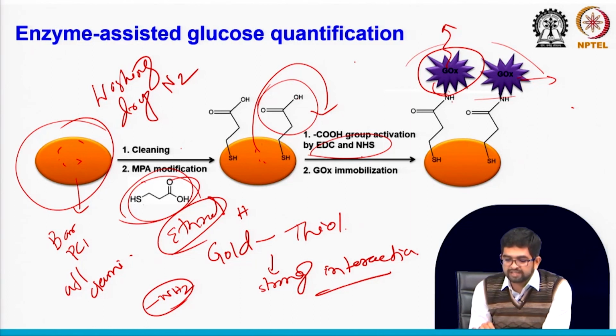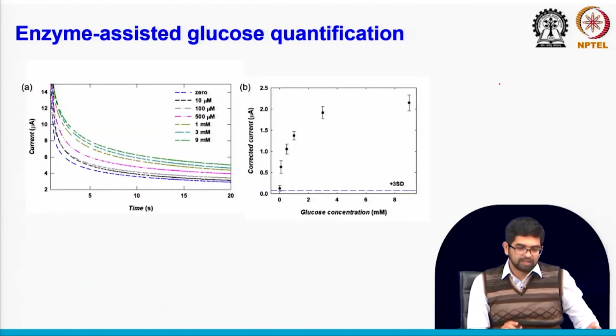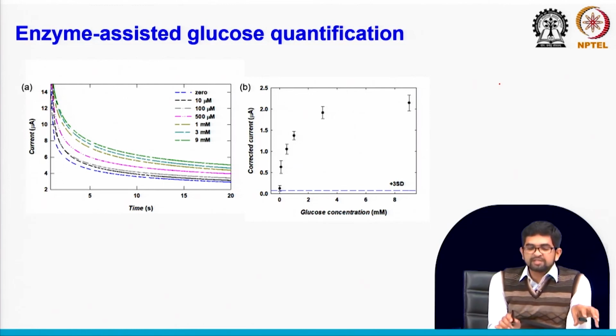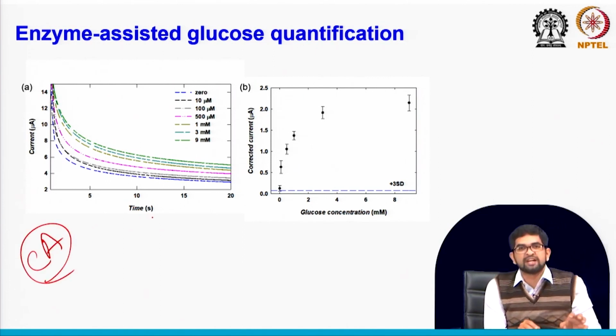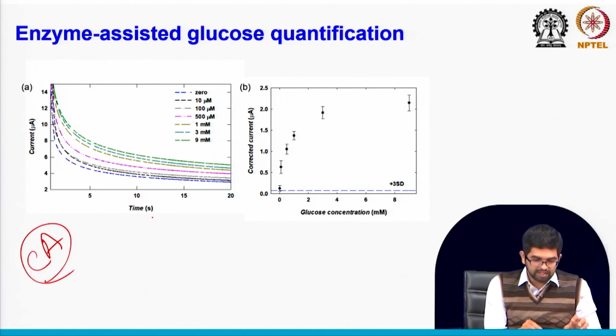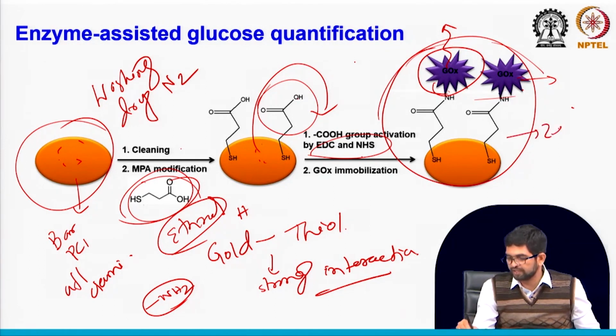But what is the advantage of glucose oxidase? Although they are proteins, they are very specific for glucose. That is the advantage. So now, enzyme assisted glucose quantification, you can see this. This is a chronoamperometric study we did, and you see different concentrations, like the zero data. So what is your zero data? It means this is the surface for the zero data.